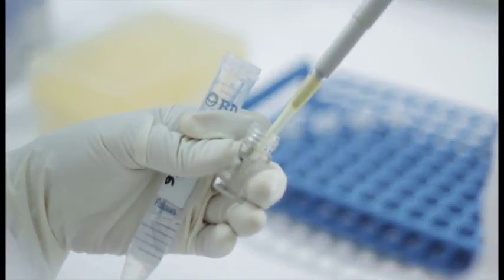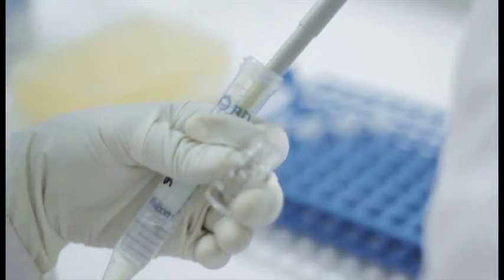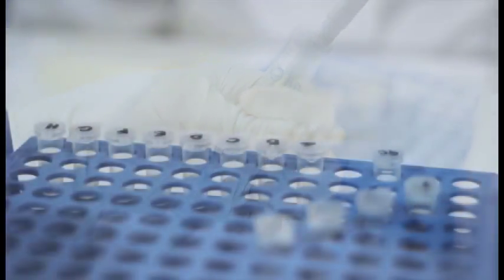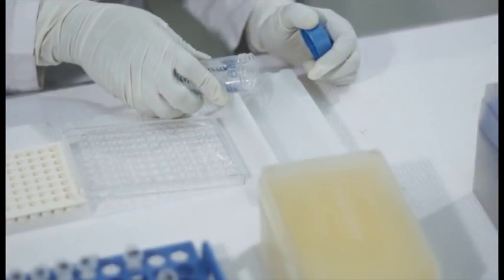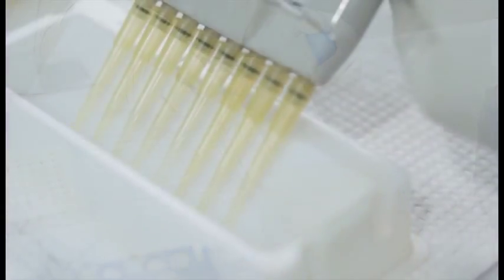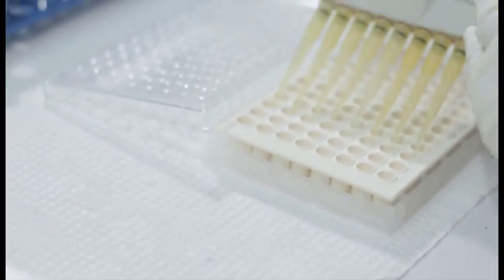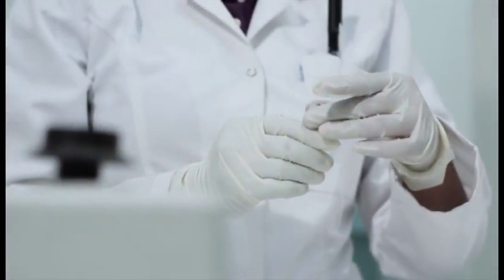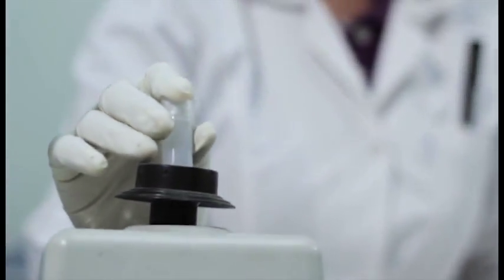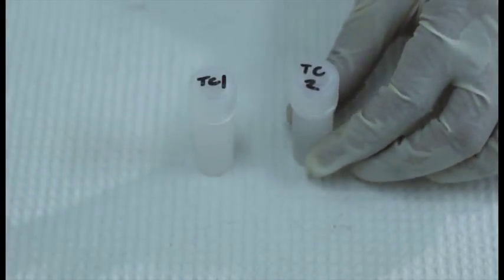The receptor binding assay uses tritium-labeled toxin, with an activity below the regulatory limit, and thus considered to be exempted from regulatory rules. However, since tritium is still considered as an internal hazard, safety precautions should be observed in handling the toxin, and good laboratory practices should be followed.